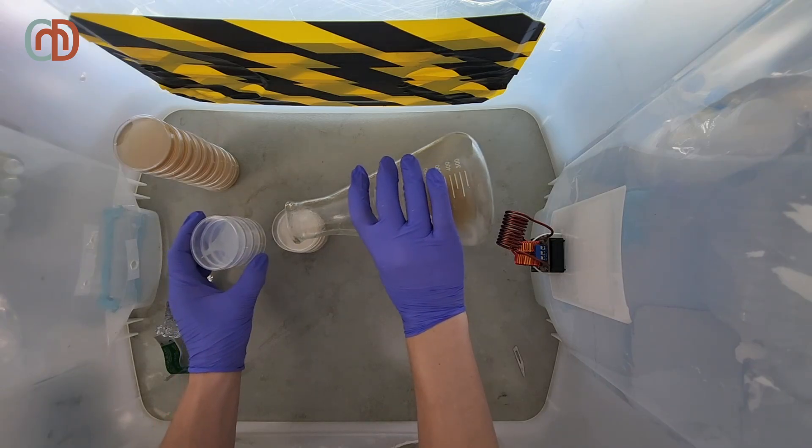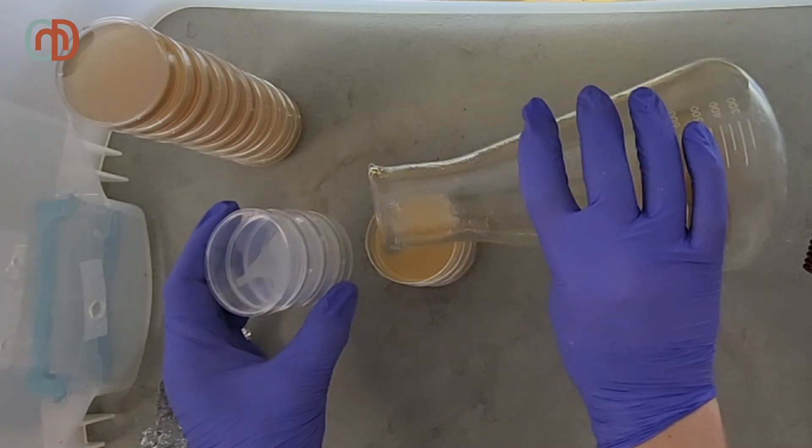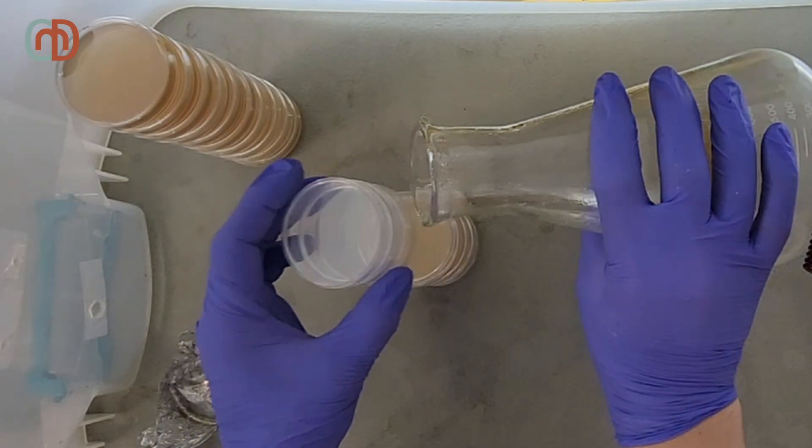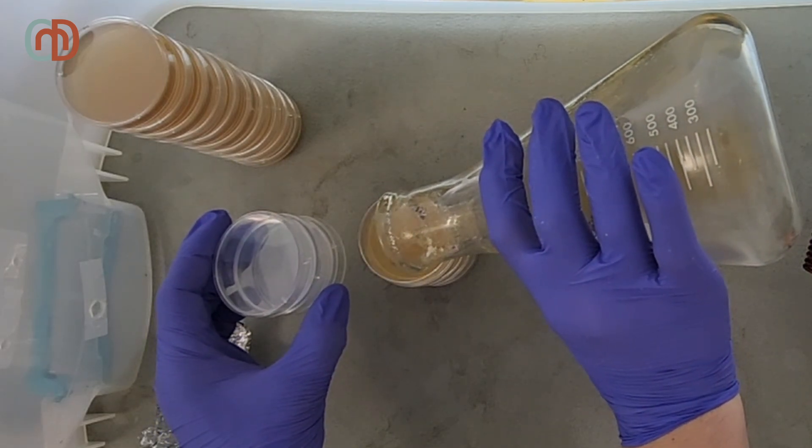I also took some of the extra agar that I pressure cooked and made some petri dishes because we'll be needing those. I did all of this work in my still air box, and if you don't know what that is, check out my video explaining them.